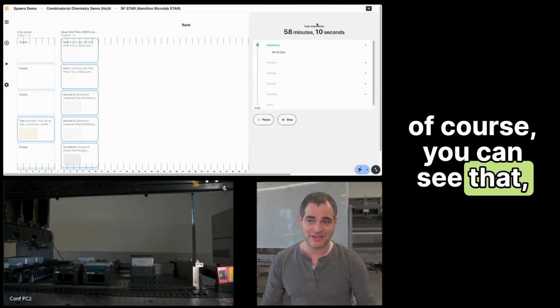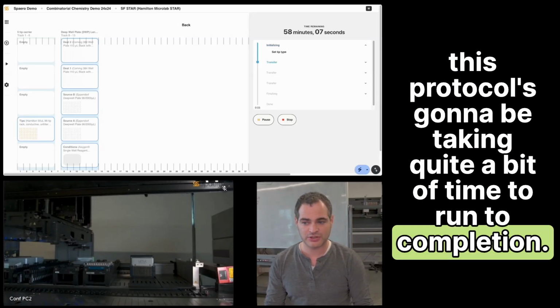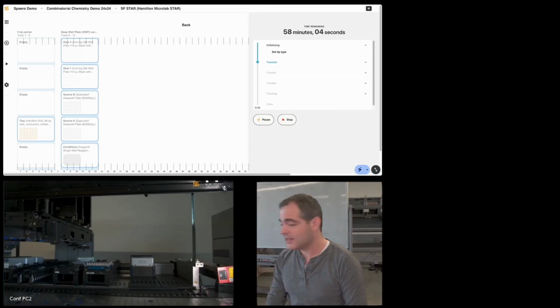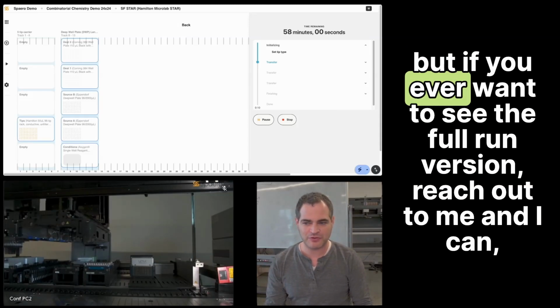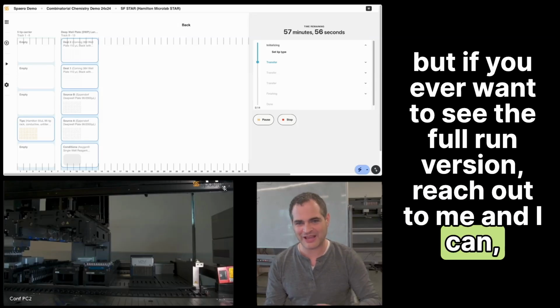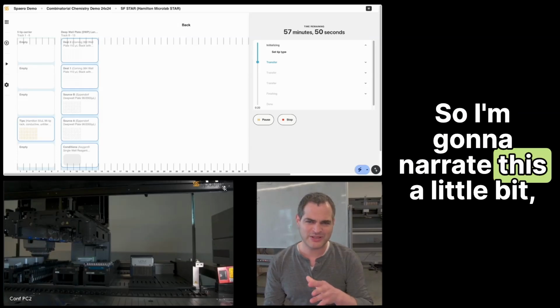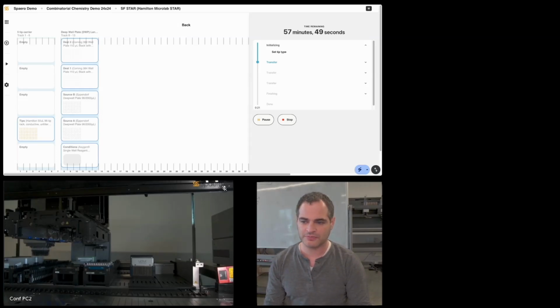Of course, you can see that this protocol is going to be taking quite a bit of time to run to completion. I'm going to cut it a little bit short, but if you ever want to see the full run version, reach out to me and I can spin this up, record the full long version for you. So I'm going to narrate this a little bit, and then we're going to close.